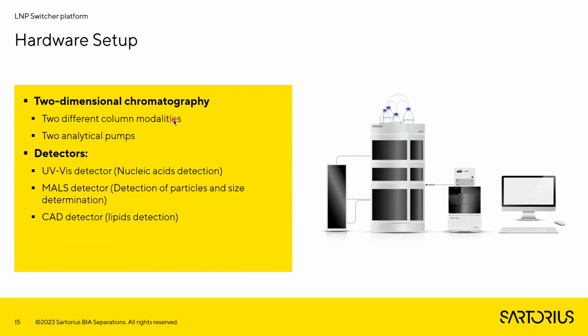Due to the complexity of the LNP sample, we cannot use just one column to obtain the wanted parameters from the sample, so we add an additional column.